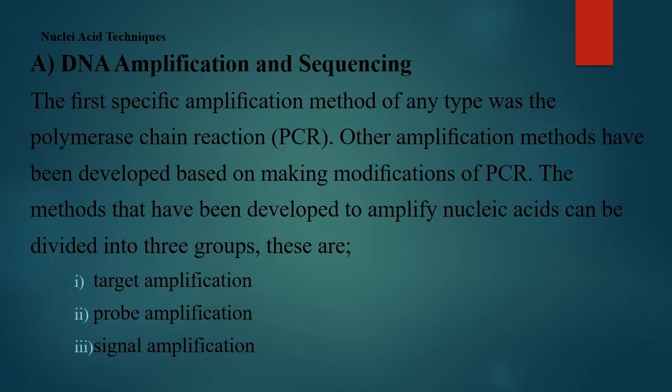Now, the first specific amplification method that was identified was the PCR, the polymerase chain reaction. Other kinds of amplification methods exist, but they are all dependent on the original concept of the polymerase chain reaction.